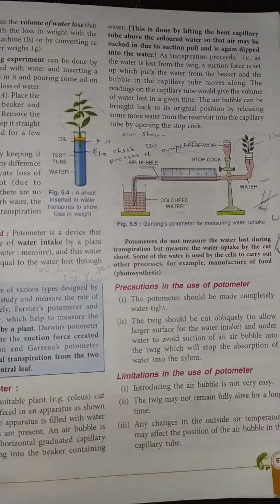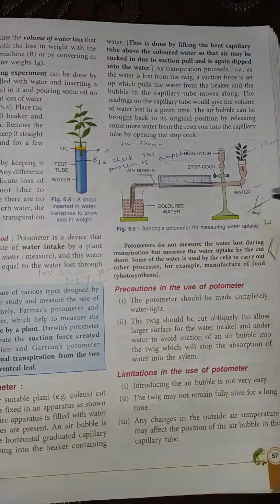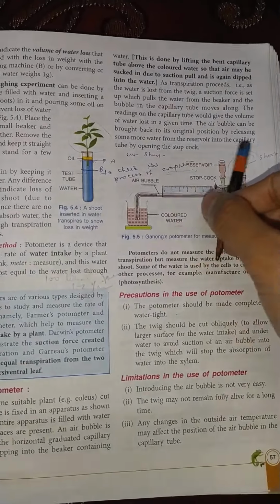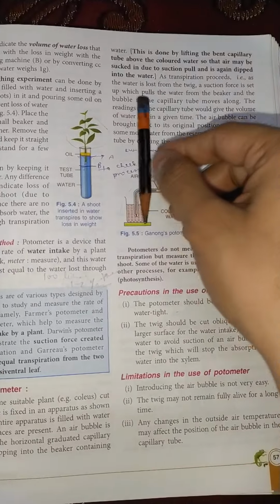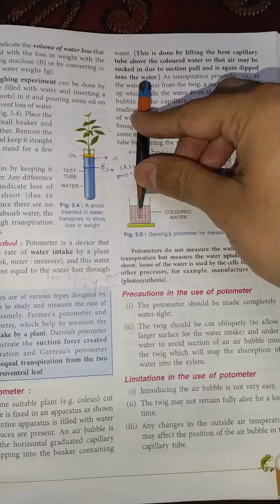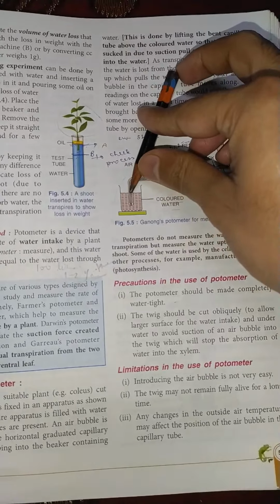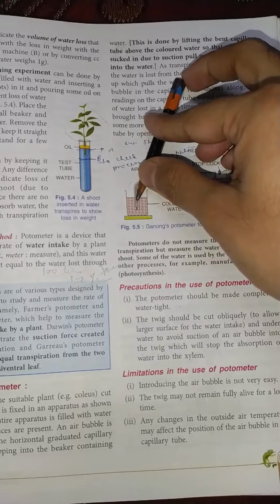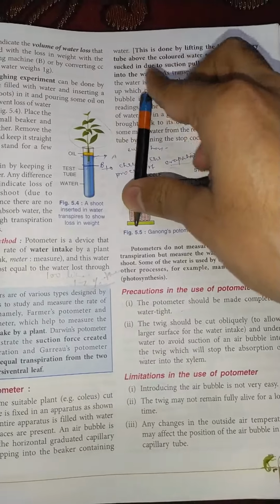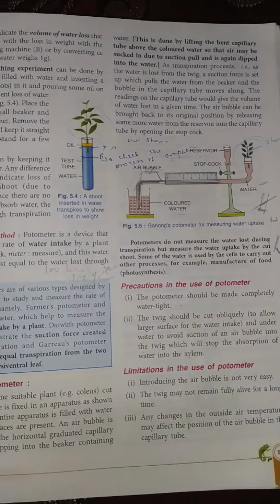One more thing: after taking the shoot, you have to introduce an air bubble in the capillary tube. How will you introduce it? Just lift this capillary tube and bend it. Concentrate here. This is the capillary tube. Let us understand that this pencil is the capillary tube. Just take it out from the water, and bend it slightly on the surface of the water. Bend it so that half of the capillary tube remains in the water and half goes into the air, so that air enters inside. After that you will dip it again. So the air bubble is inserted, and now we will keep this whole setup for our experiment.